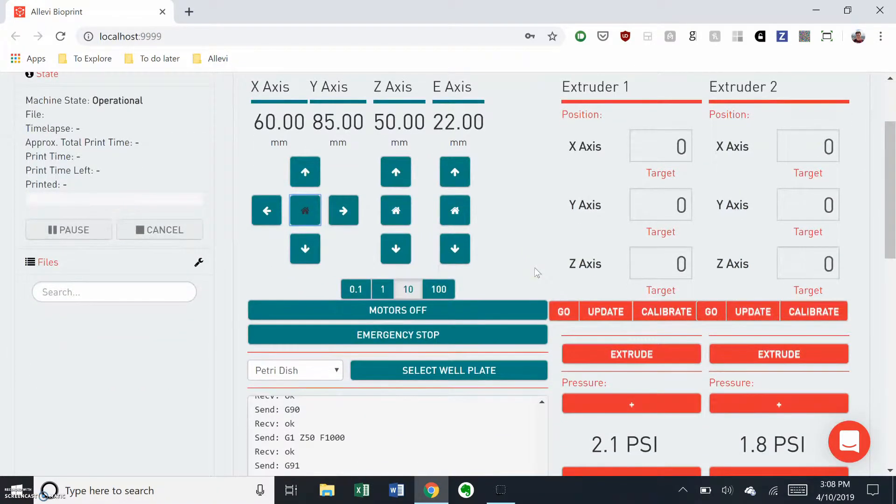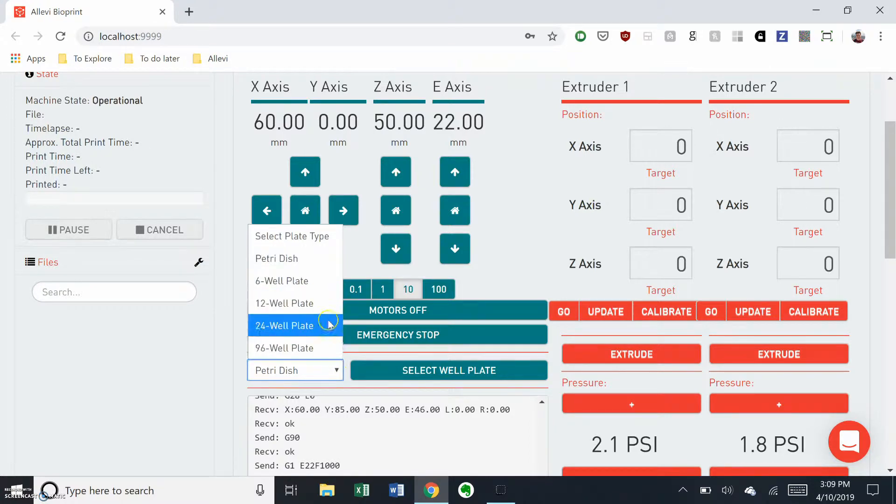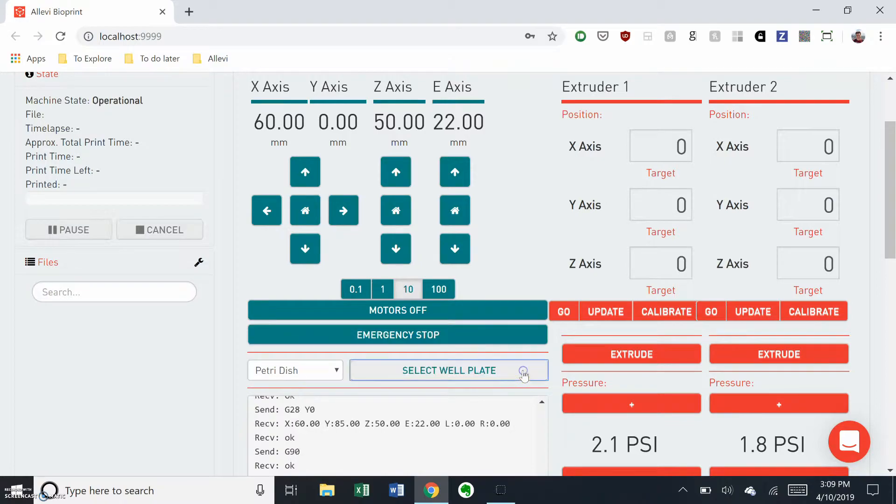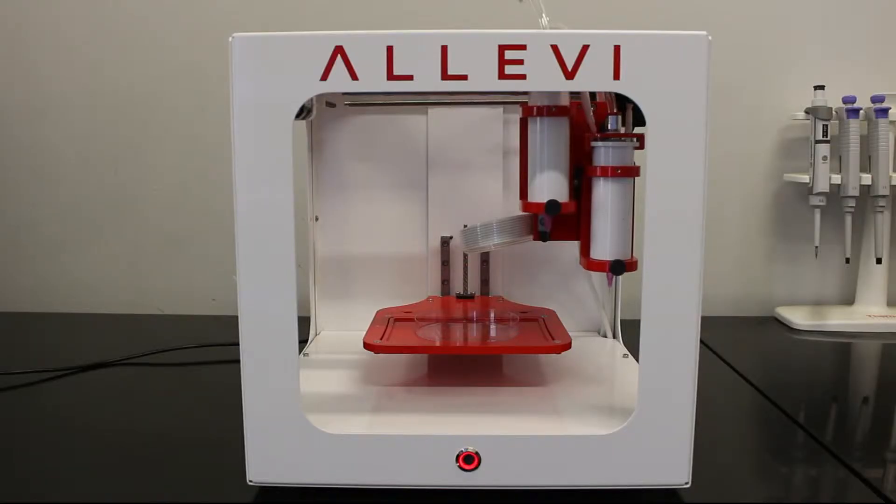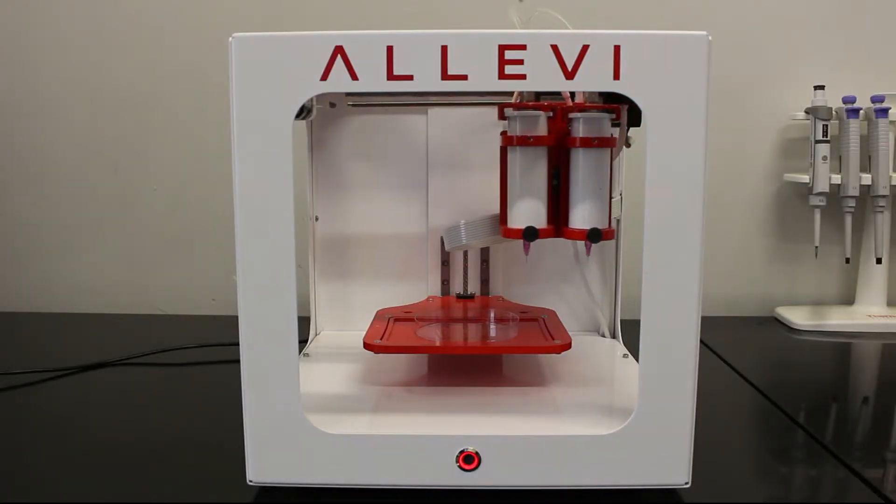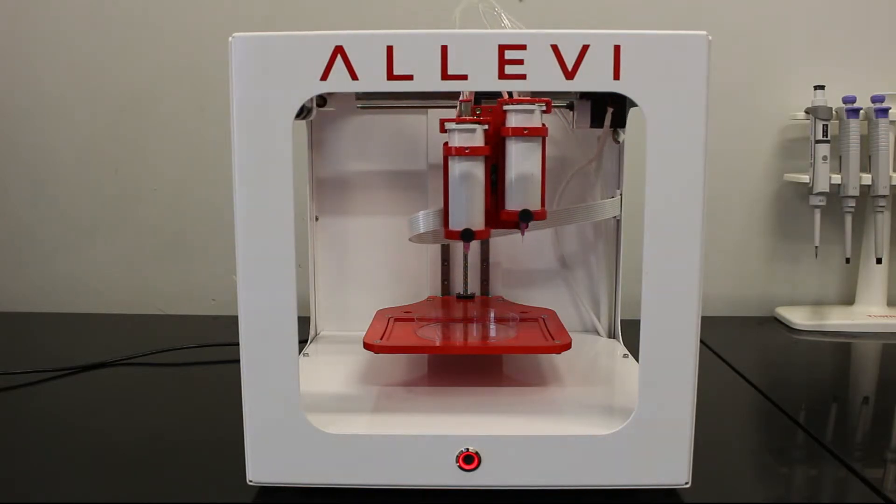Next, select your build plate. Today we'll use a petri dish, but you can choose from any of our presets. Once you've chosen your build plate, click select well plate. This will center the extruders over the build plate and activate the first extruder.